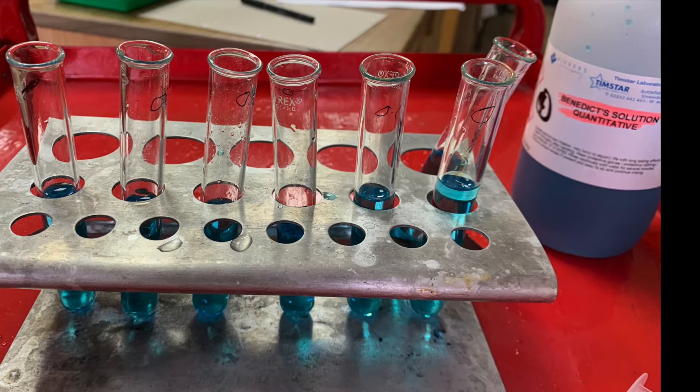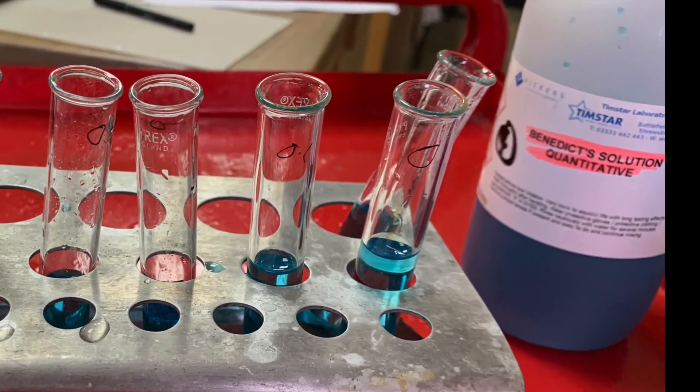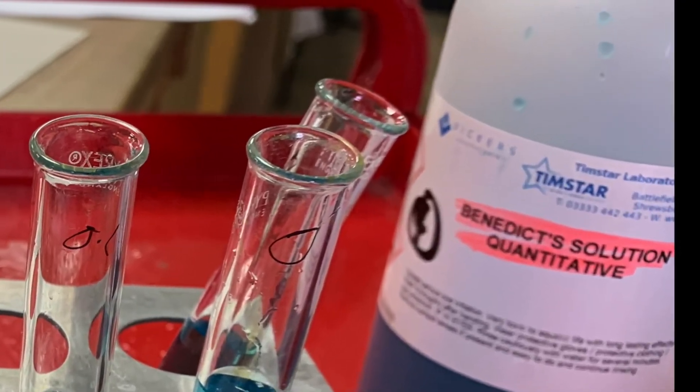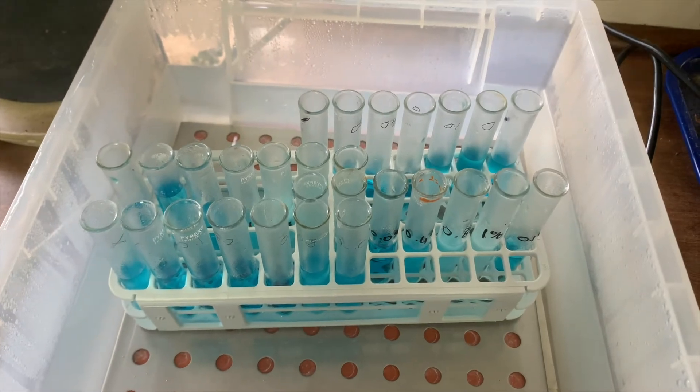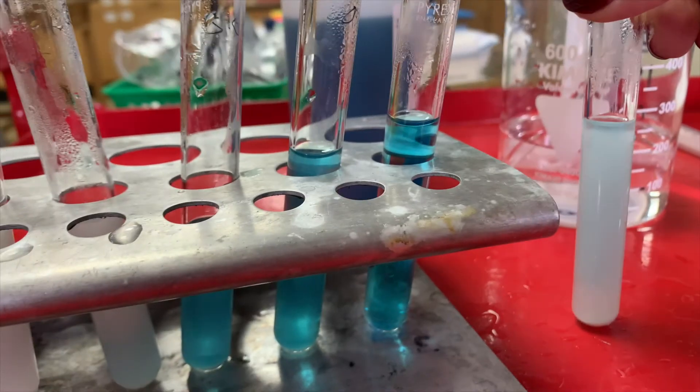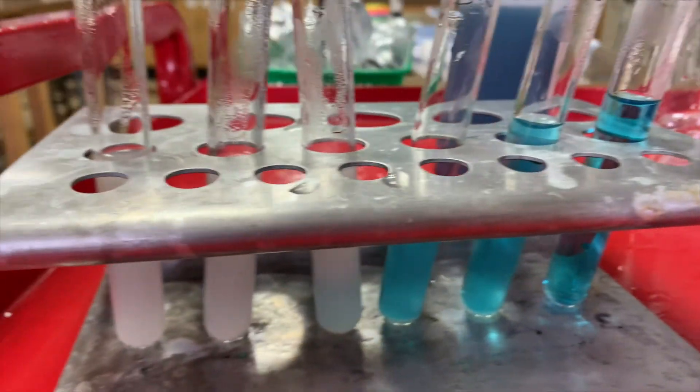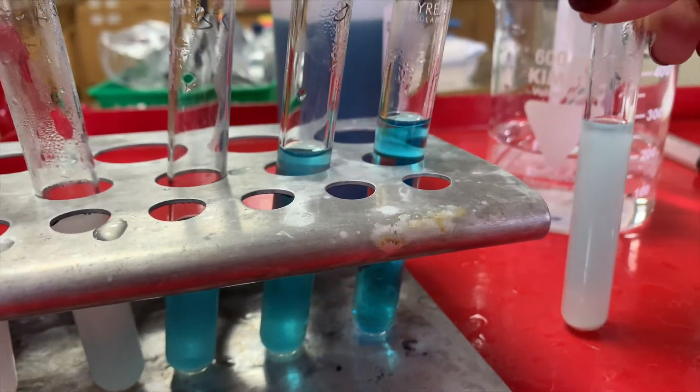Then add 3 centimeter cubed of the quantitative Benedict's reagent to each tube. Place all seven boiling tubes into the boiling water bath and leave for five minutes. Then remove the boiling tubes from the water bath and stand them in a rack to cool.